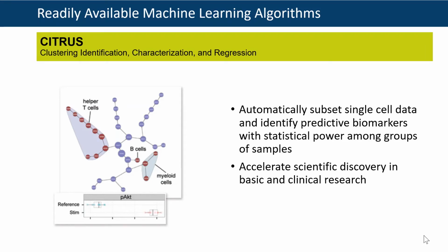So the output of this, on the left-hand side of the screen, you can see that we have a Citrus output.